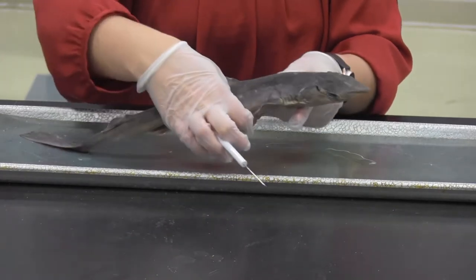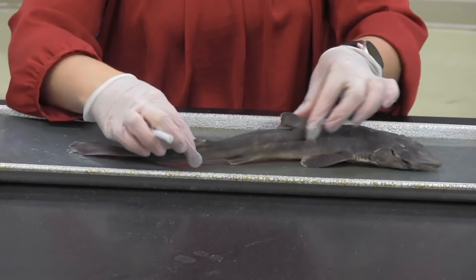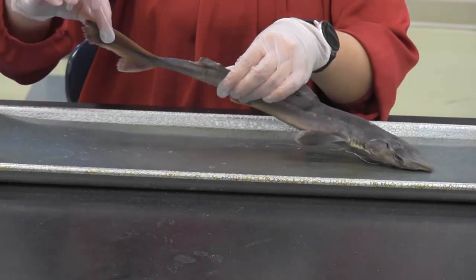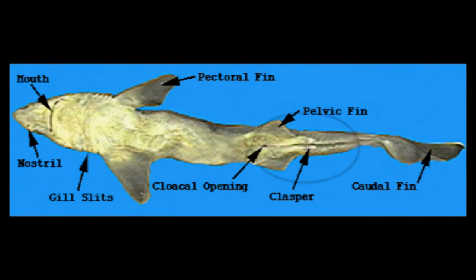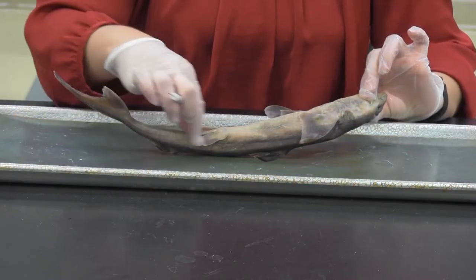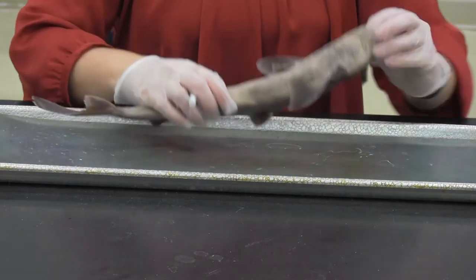And then obviously all of our fins. We've got the paired pectoral fins up here, the two dorsal fins — anterior and posterior — and we have the caudal fin. Underneath we have the pelvic fin, which opens up into the cloaca. This is actually a female. If it were a male, there would be two appendages extending from this fin called claspers. This one doesn't have them, so it is a female.